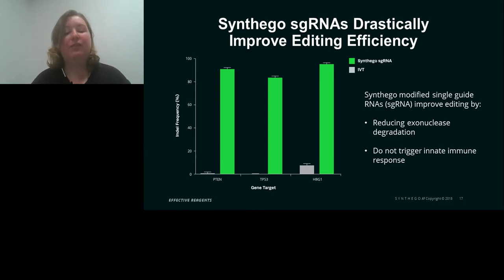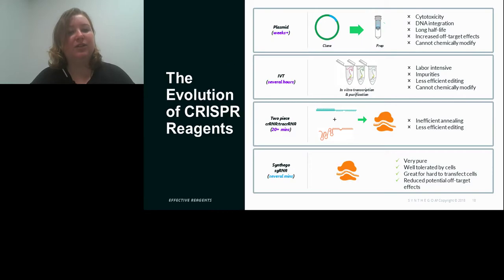So we're able to have a huge increase in editing efficiency just from the format. And so talking about format, there's lots of different ways that people have made CRISPR reagents. And so there's been a very big evolution in those reagents.